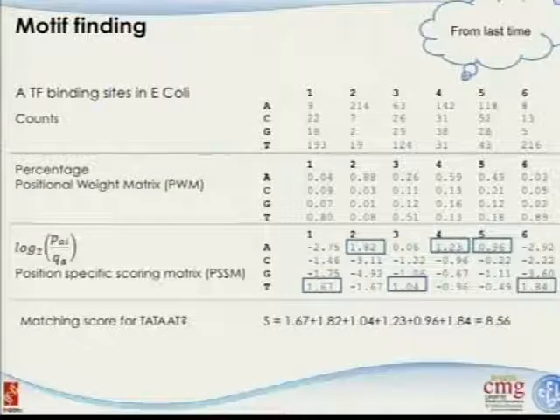And after the ChIP-seq data analysis, all the previous effort was trying to see where the binding sites occurred, just based on signal processing, just looking for the experimental signals. But after you identify the regions where the binding occurred, you want to understand a little bit more about the features of this protein binding. For example, you have a transcription factor, let's say AP1. I want to know AP1's binding site, what the site is, what the motif is.